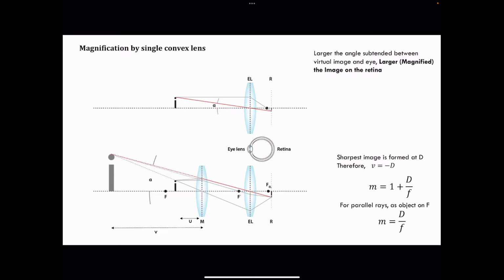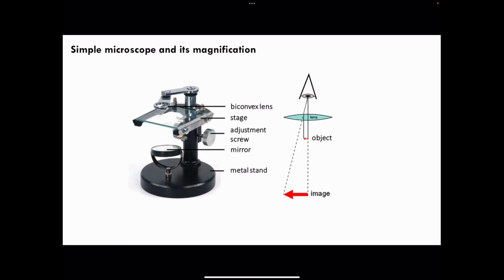Okay, so let's now move to a microscope system. When I say microscope, it is going to do the same job for you. It's going to magnify an image. Now, a microscope can be as simple as something like this, and it's simply called a simple microscope, and we are going to see how it magnifies your object. It is basically used in developmental biology labs. Previously, these microscopes were routinely used in such labs for the dissection of your model organism, which you are going to study in your research to answer your research question.